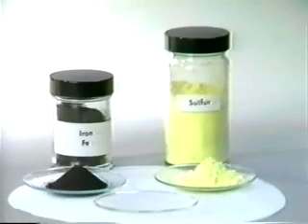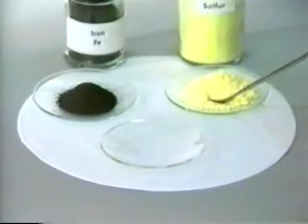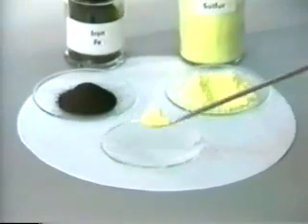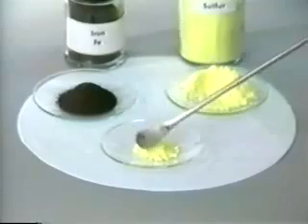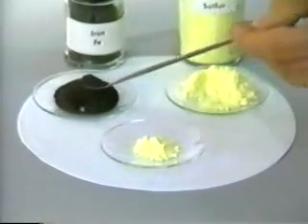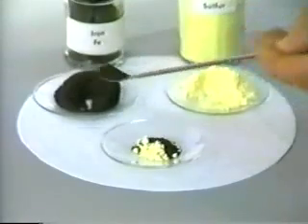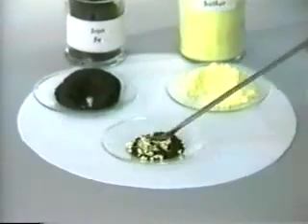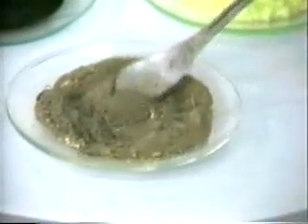In this experiment, we will first make a mixture of black iron filings and yellow sulfur powder. Black iron filings and yellow sulfur powder are thoroughly mixed. They form a gray mixture of the two elements.